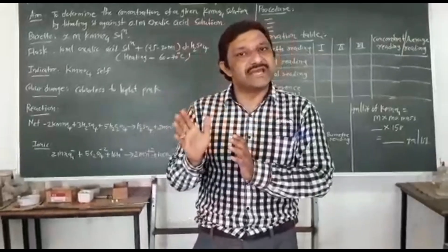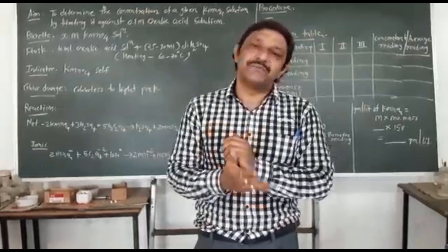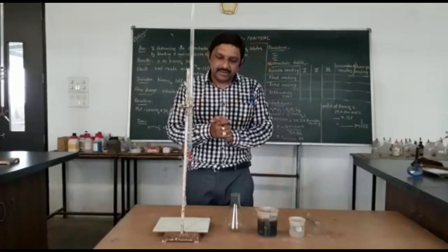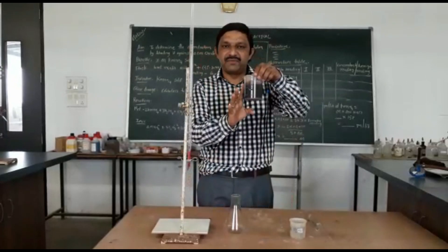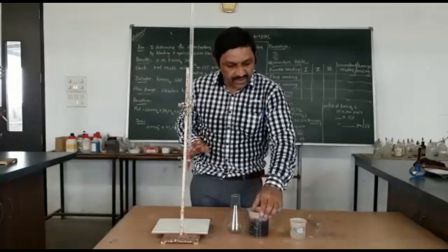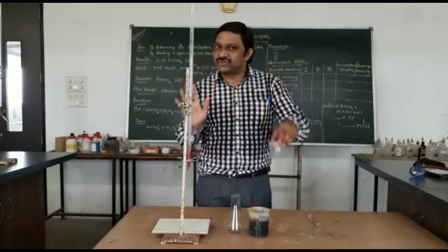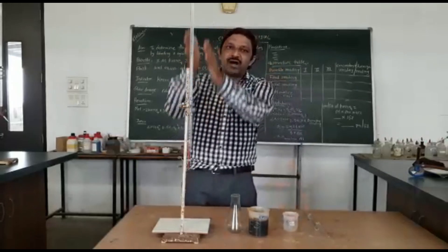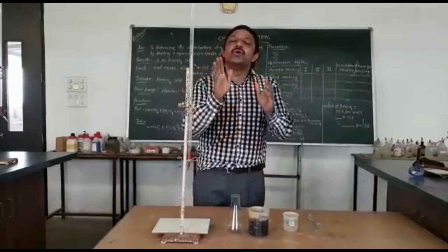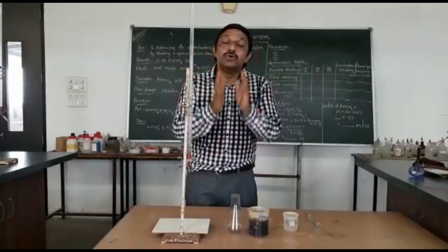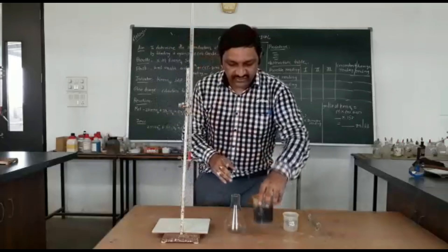Now we will start the second practical. Here is your burette with x molar KMnO4 solution, and here is your 0.1 molar oxalic acid solution. First of all, we fill up the burette with KMnO4 solution — take the upper meniscus reading as you all know.